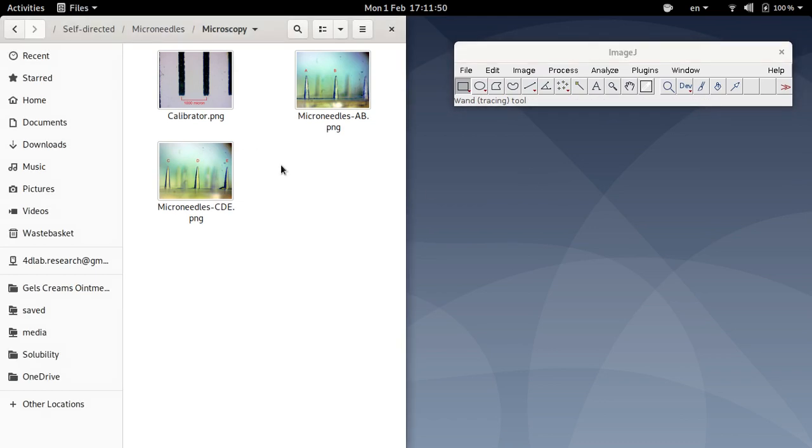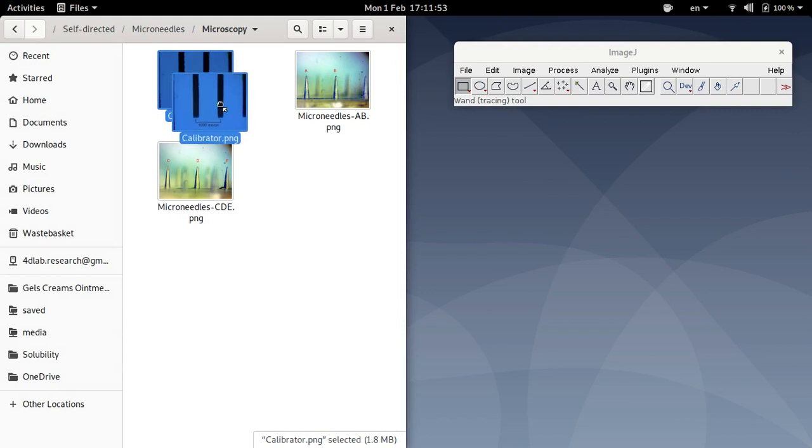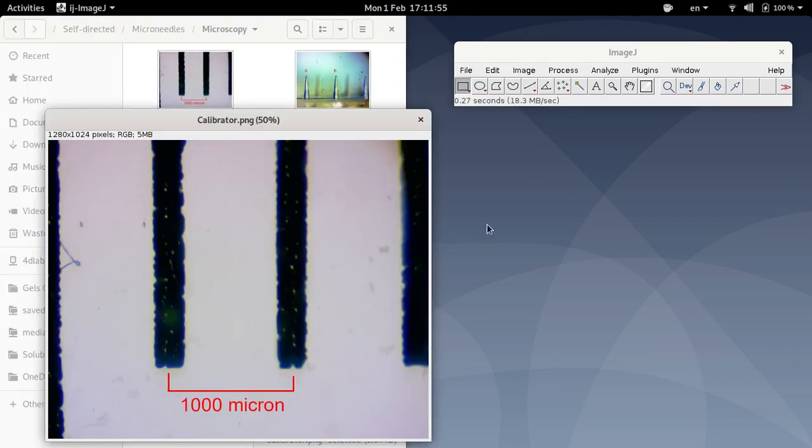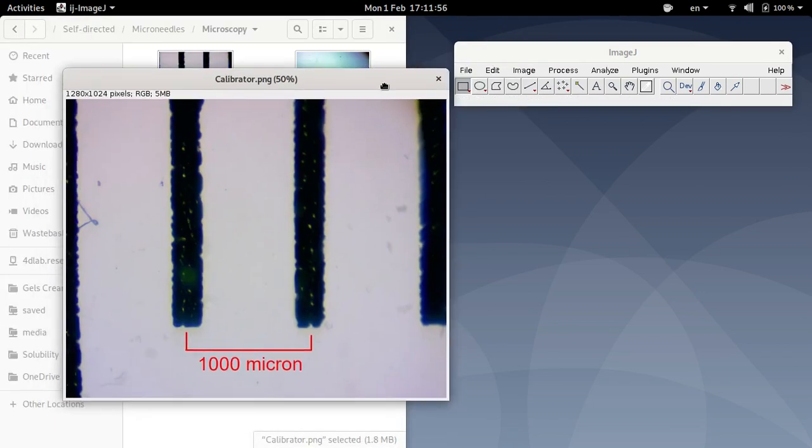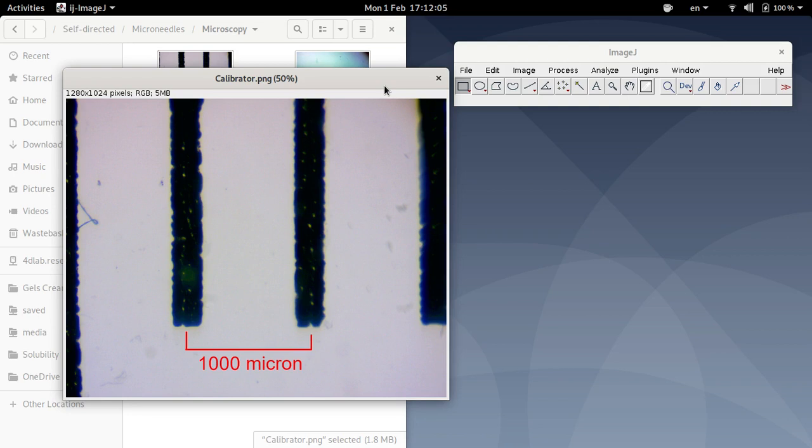So to begin with I'm going to open up this calibrator image. Now a calibrator image has to be one that is taken at the same magnification as the sample that you want to measure or you want to analyze and also the size of the object in the calibrator image has to be known as well.